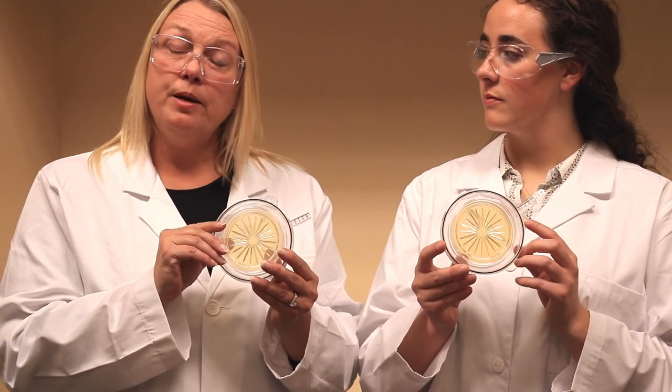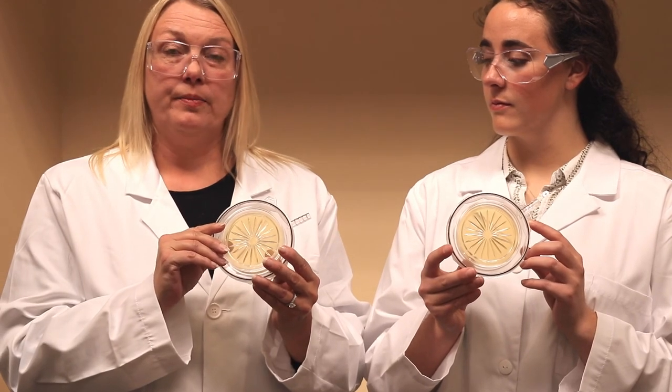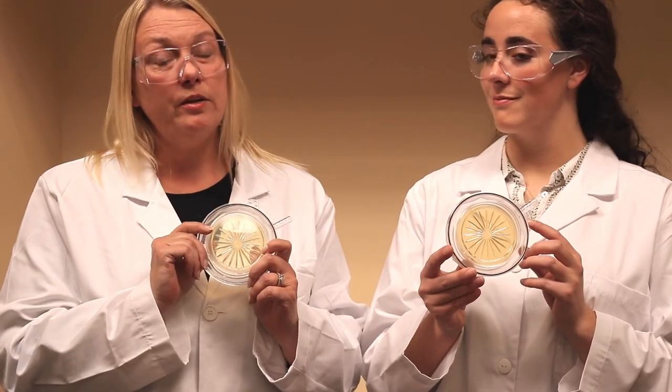These can be kept at room temperature or refrigerated. These are a great product. If you have any questions, please visit us at pmeasuring.com. Thank you.